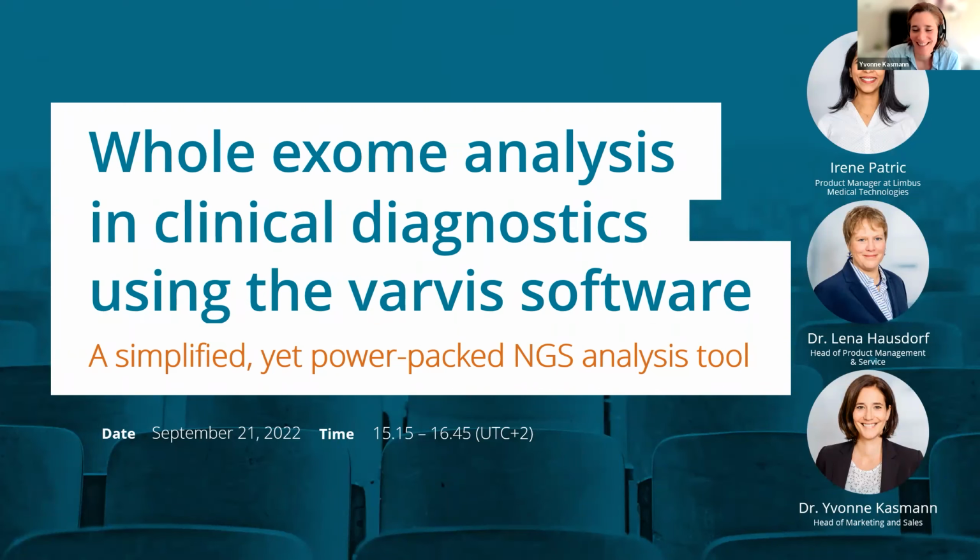It's a bit different. So we're here today to present to you the varvis software, to show you how to use it, and especially with the use case of whole exome analysis in clinical diagnostics.